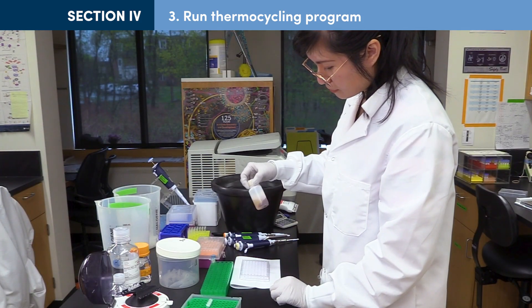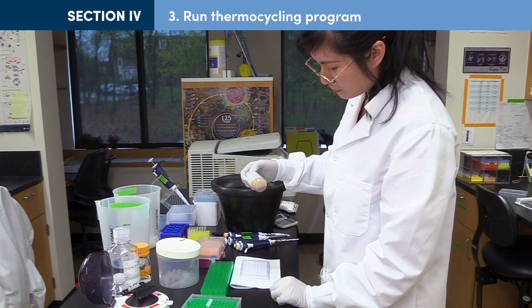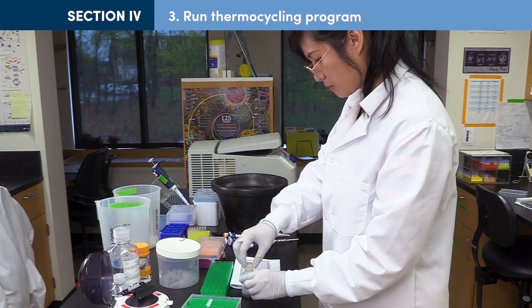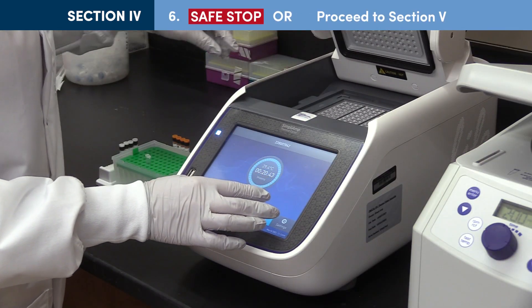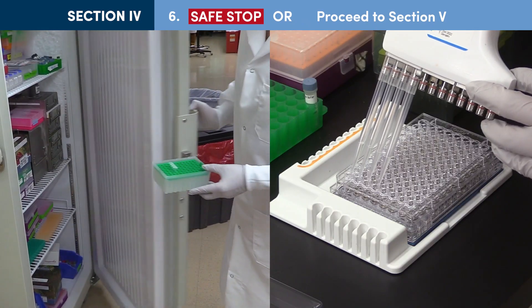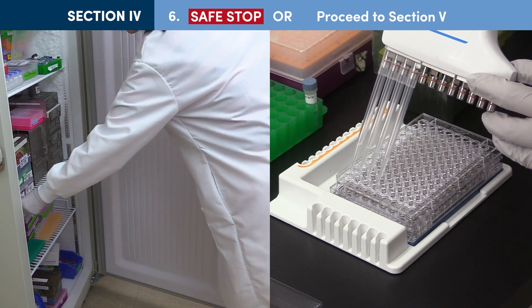If you will be proceeding directly to the next section, at this time warm up Ampure beads to room temperature for 30 minutes. After the thermocycler program is complete, samples may either be stored at minus 20°C or you can proceed directly to final cleanup.